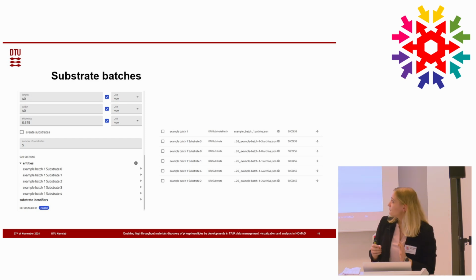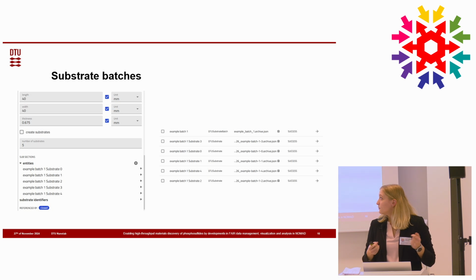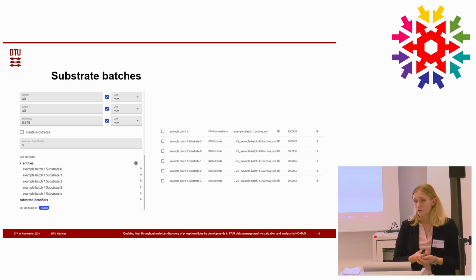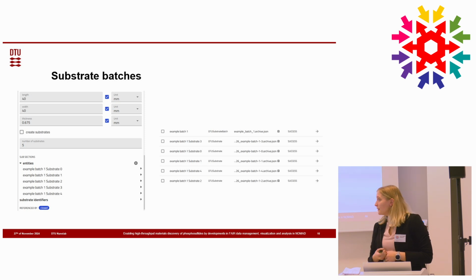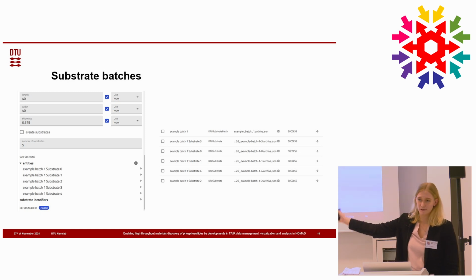The next really nice feature that we imported is that we always use the same substrates for our samples. In sputtering, we usually use silicon substrates. So about every 3 months, I spend a day at the laser cutter, and I cut 160 substrates.